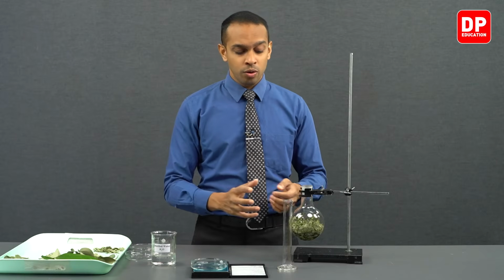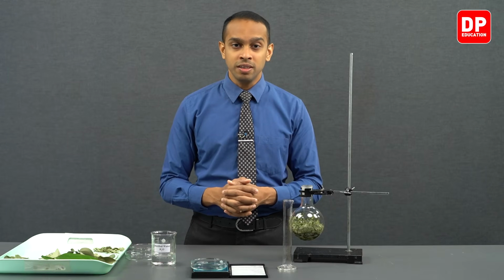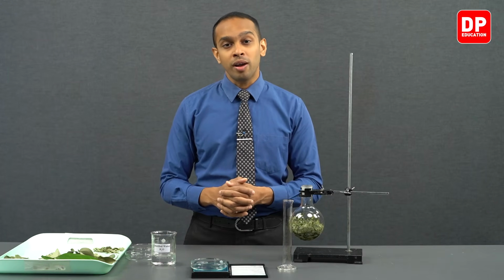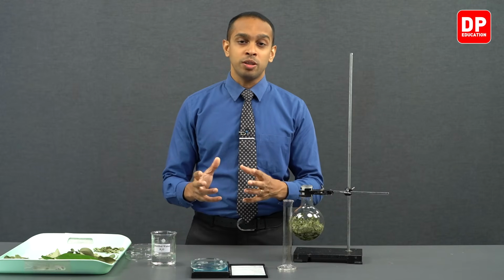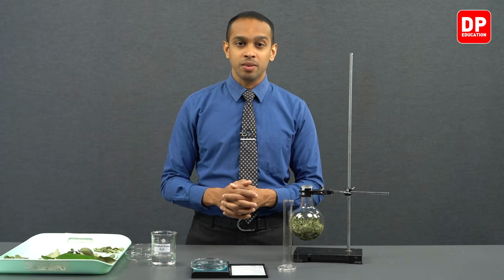However, if you were to heat them so that they boil off, before boiling off, they might undergo decomposition. So when you just take the eugenol oil that you observe here and try to boil the essential oil, before they reach their boiling point, they can undergo decomposition.